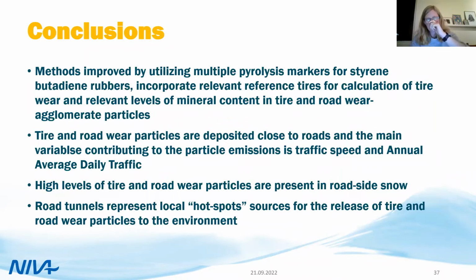Yeah, so a little bit of conclusions. I think I'm maybe on time. So in this PhD project, we have worked a lot with the analytical method. We found that the method improved by using multiple pyrolysis markers for the styrene butadiene rubbers, including the SBR and SBS in this.